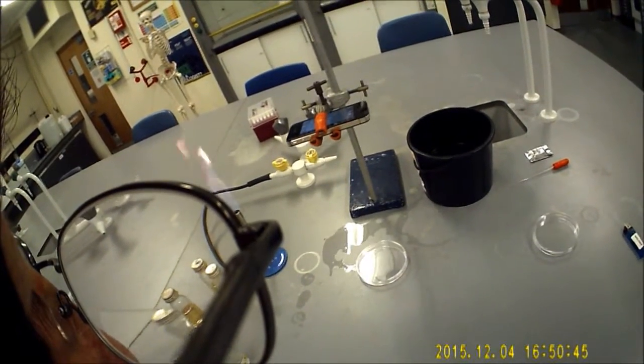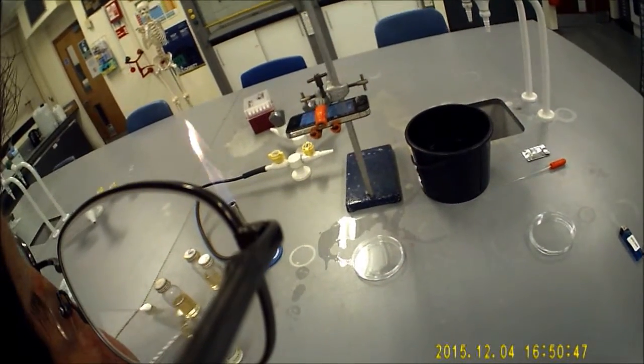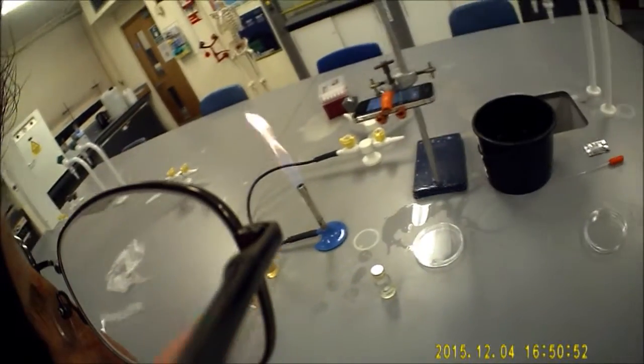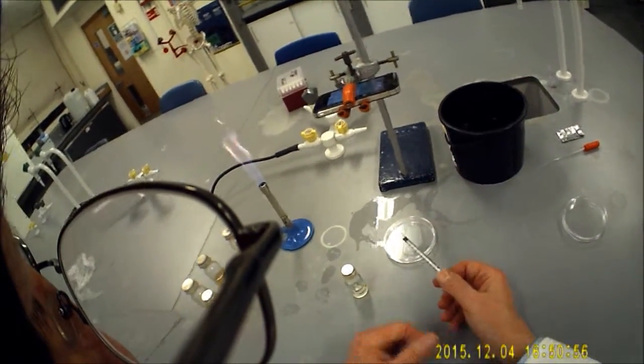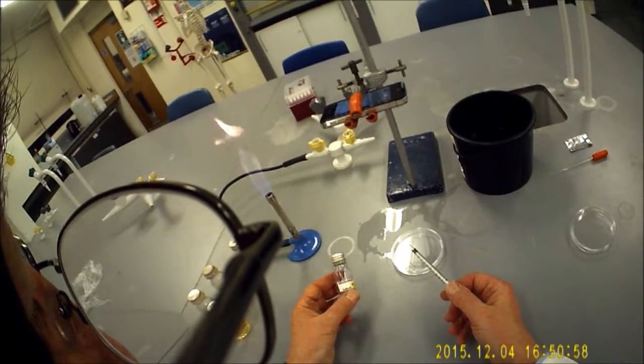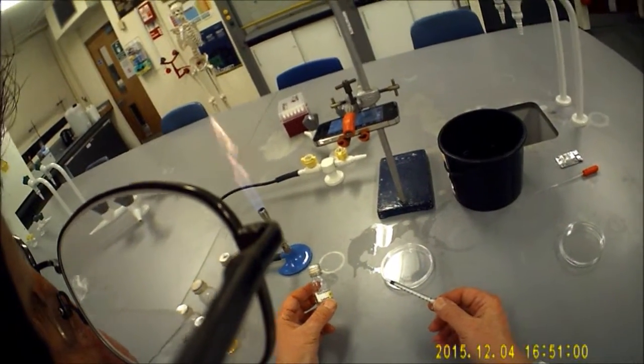I'm going to start off with method one, which is to prepare a pour plate. I'm going to use 0.5 ml of Micrococcus luteus in the pour plate.